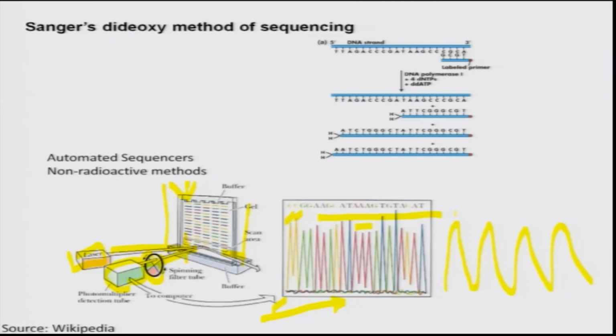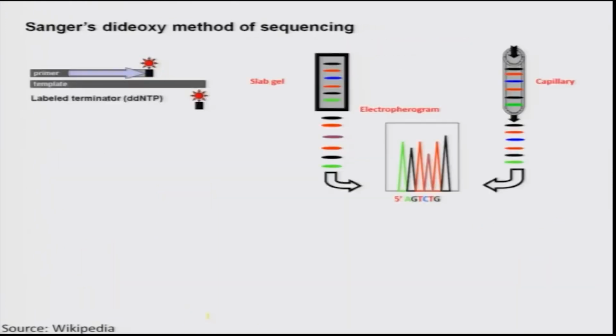It has changed. So, this is the first generation of automated DNA sequencers, right. So, still you use gel, cast gel, and you have to load sample, do a reaction and load sample, but separation and reading the sequence was automated. So, it really changed, but things have gone much better.